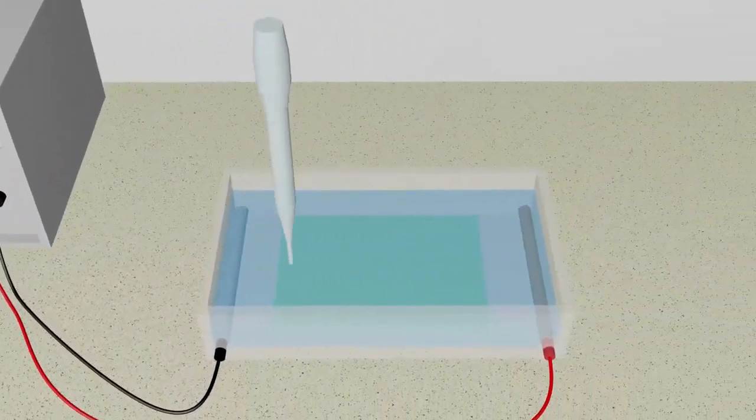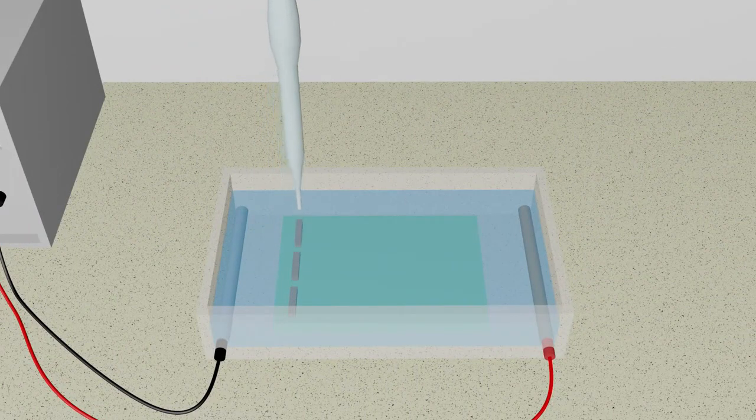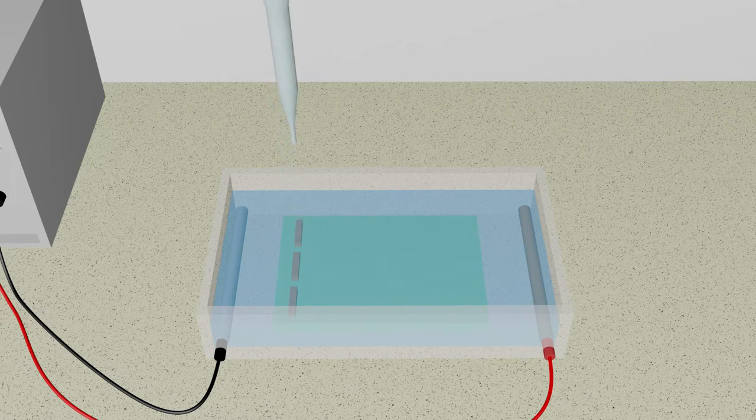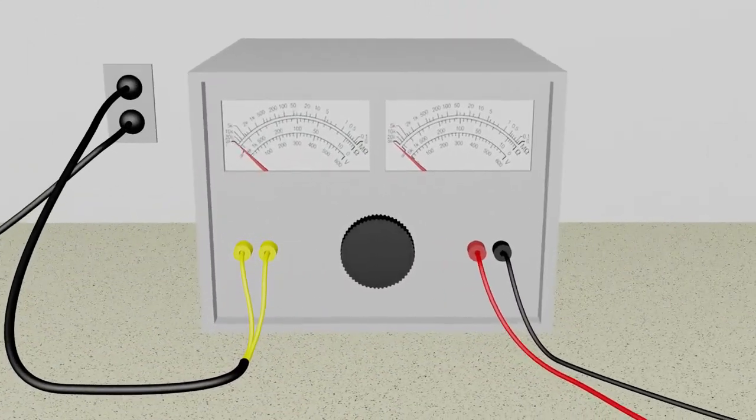Holes are created in the gel that serves as a reservoir to hold the DNA solution. Mixtures of different sizes of DNA fragments are loaded into a well in the gel. The force needed to draw the DNA through the gel is provided by electricity.